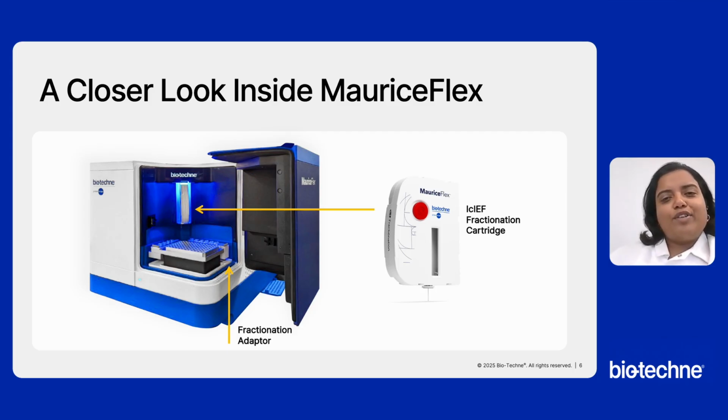If we take a closer look inside the MauriceFlex, those of you who are familiar with Maurice will find that MauriceFlex is very similar, except for the additional adapter that will be required to hold your 96 well plate and the reagent when using the fractionation cartridge. If you are working on your regular icIEF or CESDS applications, you won't need to use the adapter. You will be working on your MauriceFlex platform as you do on your regular Maurice.